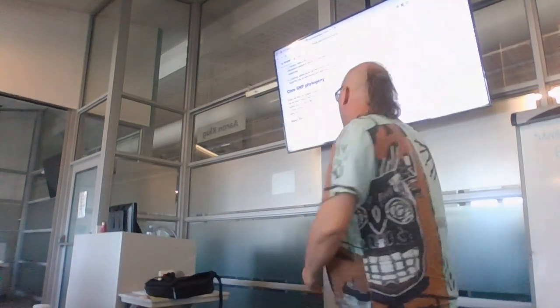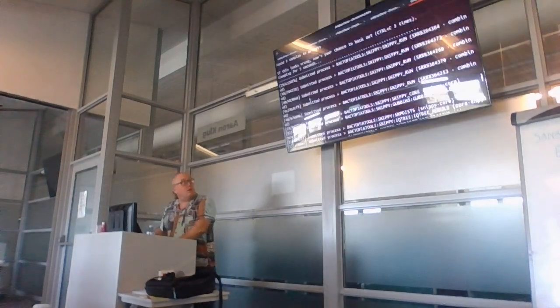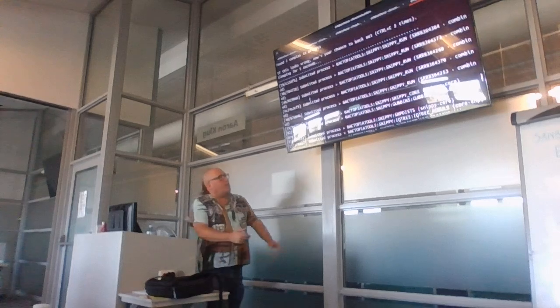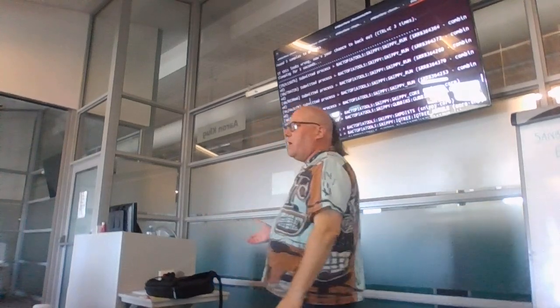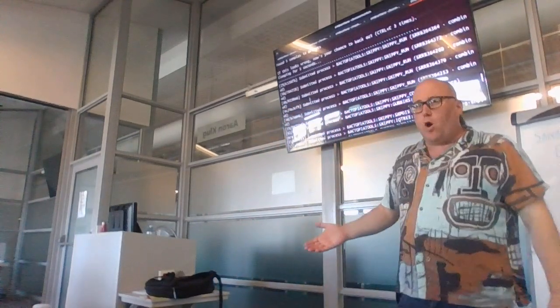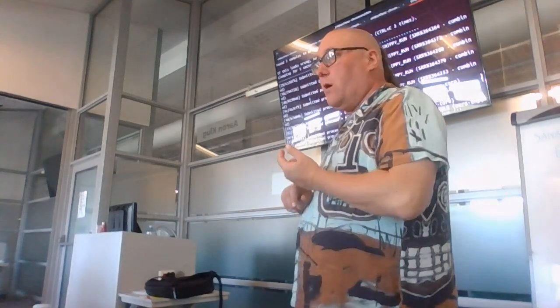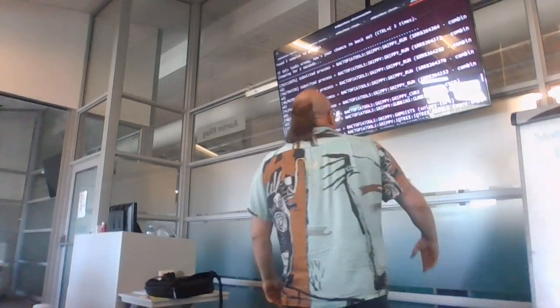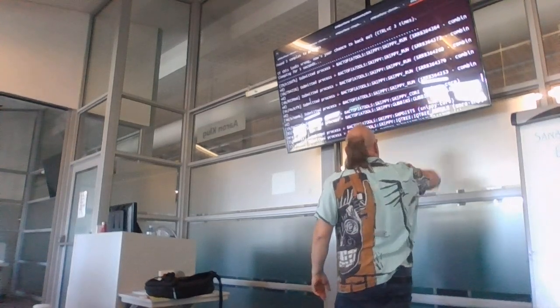Okay, we see when the Snippy process runs, then we see down here at the bottom IQ-TREE, which you might recognize from other bioinformatics courses, is a very commonly used maximum likelihood phylogenetics program. Okay, but there is something in between called Gubbins.